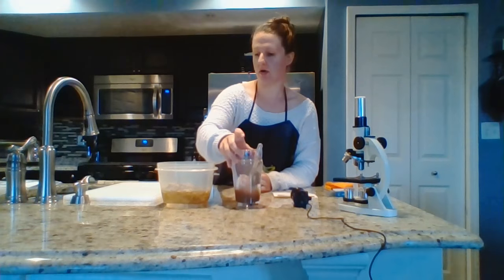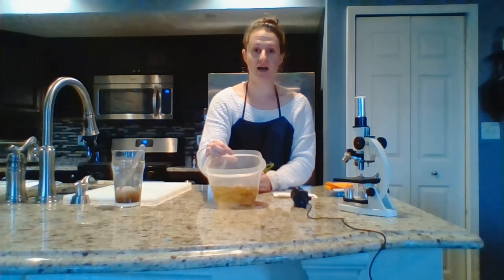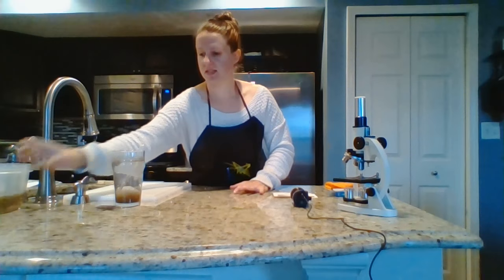I've also set up my hay infusion soak in just a regular Tupperware container. This is an optional step in this microscope lab that you do not have to do. It's also not on the lab report that you'll hand in in the Dropbox. So put those aside.